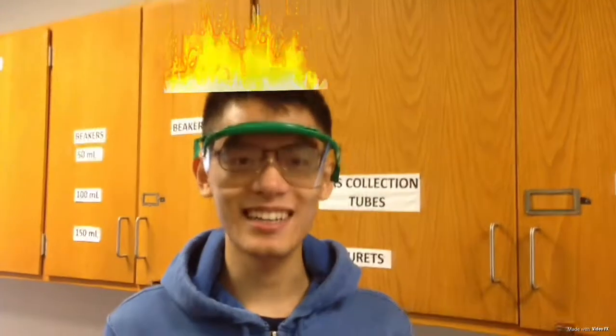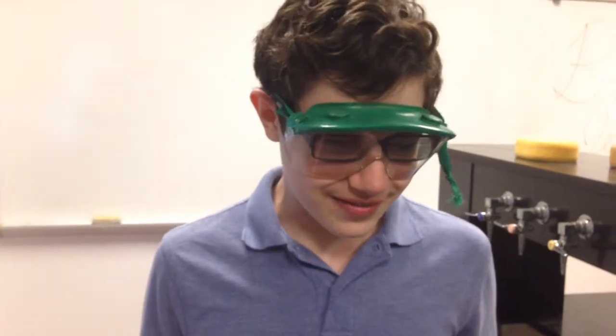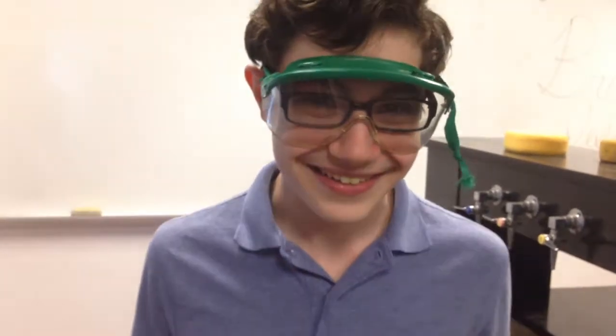Something to always remember is lab safety. This might not be the lab safety demonstration, but it's something you should never forget. This is what happens if you don't tie your hair back. We aren't even working with fire for this lab, and you don't even have long hair. Well then why is my hair on fire? Why don't you tell me?